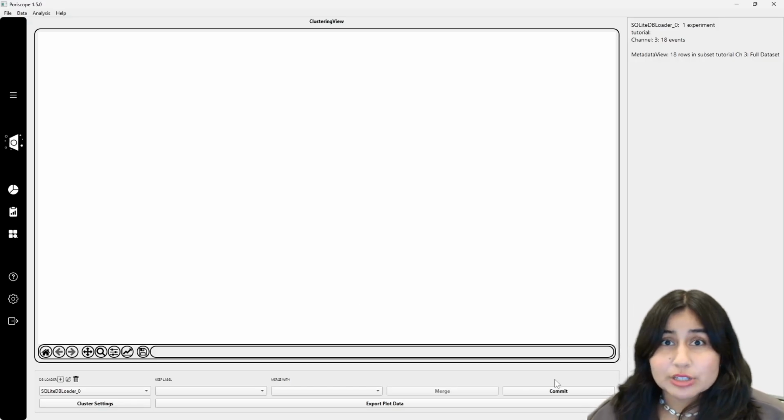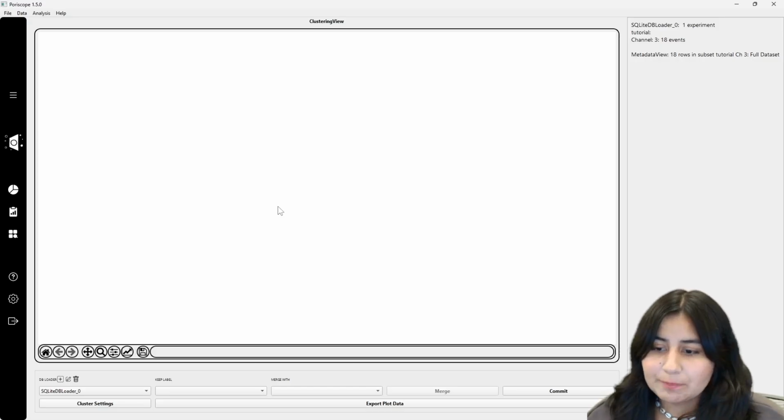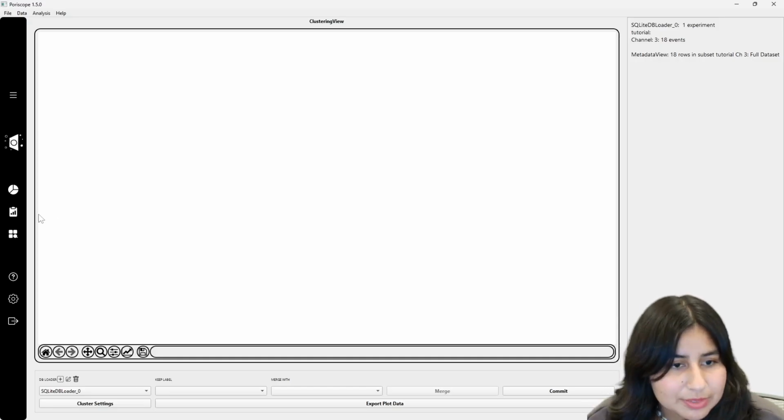This is something we were talking about earlier in part 2. If you remember, I committed my clusters to this database, so it added 2 columns to it, one of them being cluster labels. So I could say, okay, I actually want to do subsets with those clusters that I have now. I want to deepen my analysis for that database.